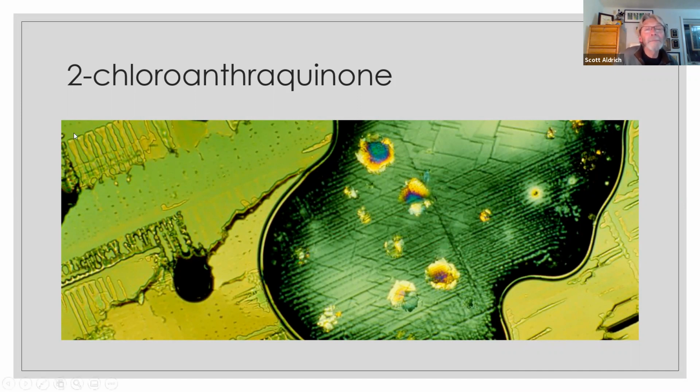But again, this is all the same chemical, and this is a void. It's very thin here and striated. It had nucleated here, another void. But the way it aligned, it just made a striking image.